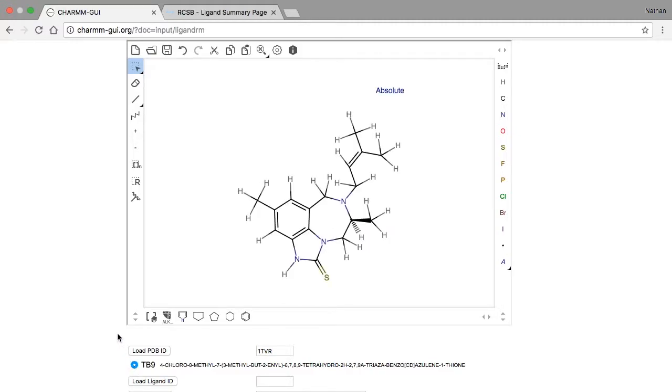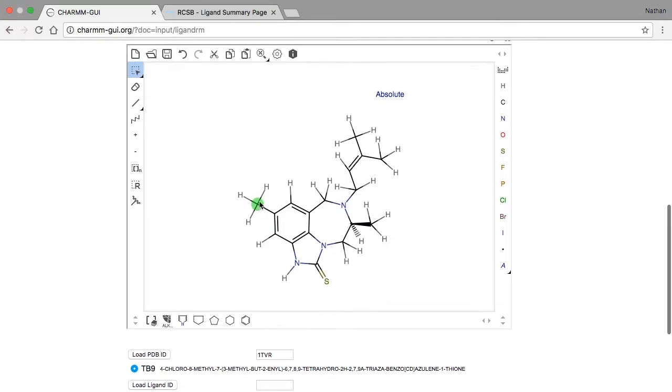There are three parts of this molecule we will focus on. The first is this double bonded sulfur atom, next is the single hydrogen atom attached to a benzene ring, and the third part is this methyl group also attached to the benzene ring.